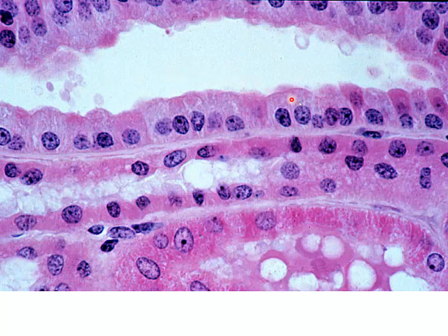Now, as we look even further, we can see some of these taller, more reddish looking cells, dome-shaped on top, and you can see these nuclei are even in a different plane. These are going to be our intercalated cells or our peg cells, and that's also going to help us know we're looking at a collecting duct that's present here.